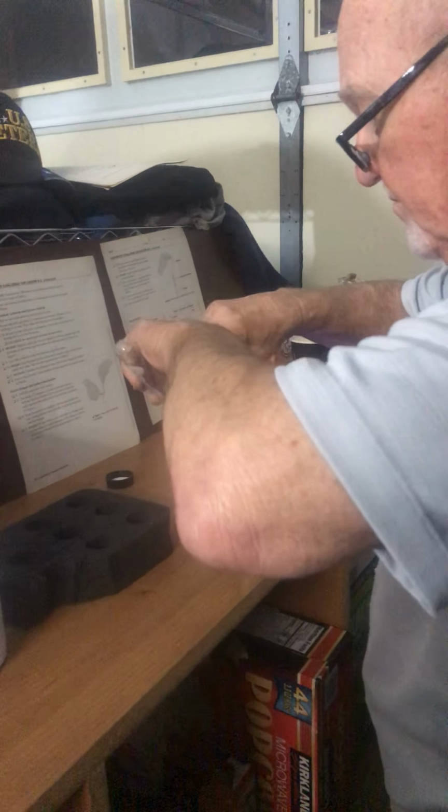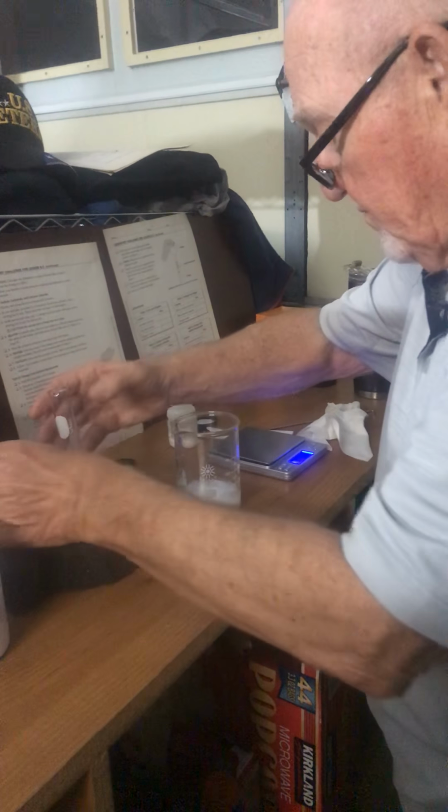In they go. Now we can see some reactions already. Looks like there's some bubbling in there. You can see some definite bubbling up there. Let me stir it up just a little bit. Okay. You can see on the sides, there's bubbles on top.